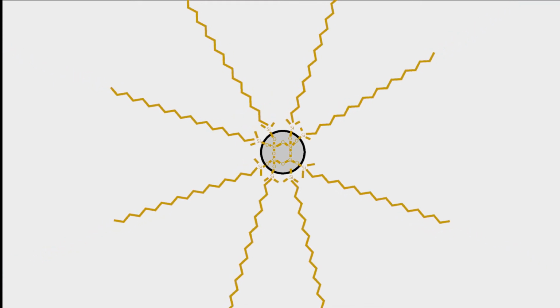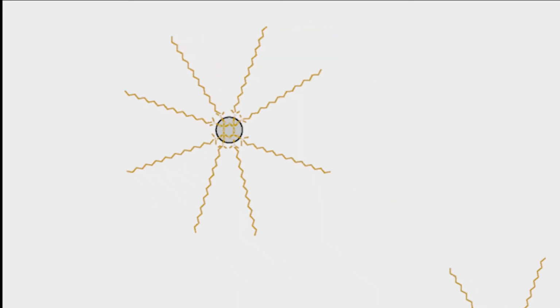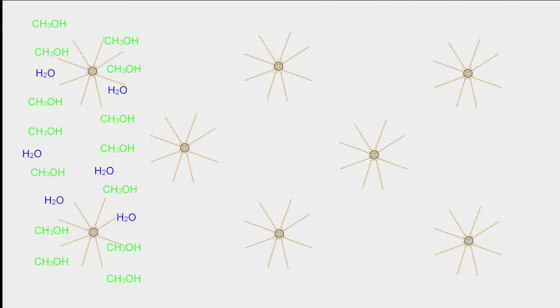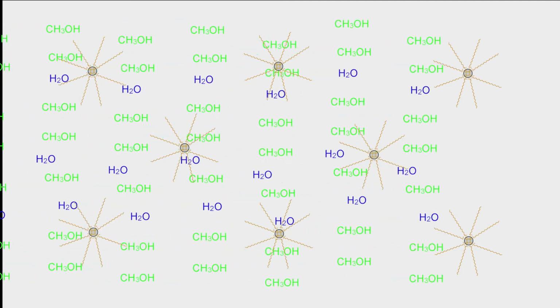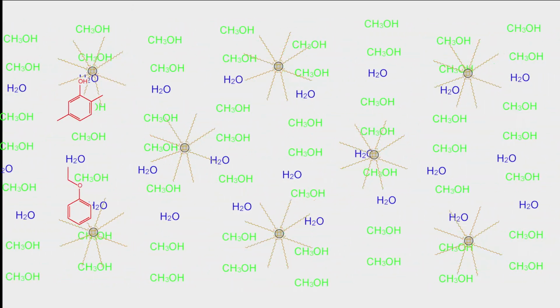On the surface of these particles, silanes are grafted. In this practical, the column is C18, meaning that dimethyl octadecyl silane is grafted to the surface. These 18 aliphatic carbon atoms make the particles nonpolar. These particles are tightly packed in the column to ensure they have a very good interaction with the analytes and the solvent. In the case of reverse phase HPLC, a polar solvent, such as a mixture of methanol and water, flows through the column between the particles.